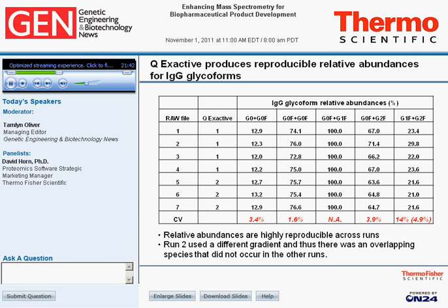One thing of interest, though: raw file number 2 was actually a markedly different gradient than all the other ones, and it turns out that there were some other species co-eluting that interfered with the abundance of the higher mass glycoforms. So 6 out of the 7 of those runs have very reproducible measurements, and then one of those runs looks like an outlier. And that tells us about the sensitivity of the method: raw file number 2, with a higher G0F, G2F and higher G1F, G2F, there's something wrong with that sample. There's something different about that sample. So it looks like our sensitivity, based on these data, is actually within a few percent. Next slide, please.